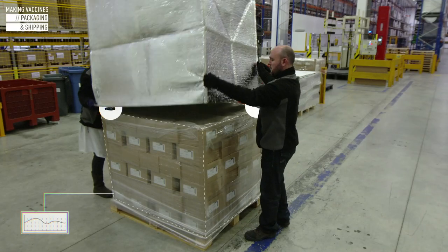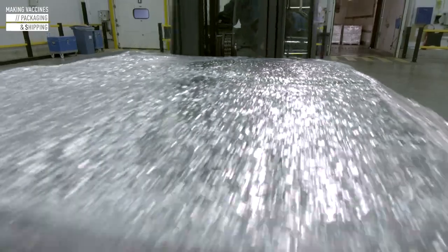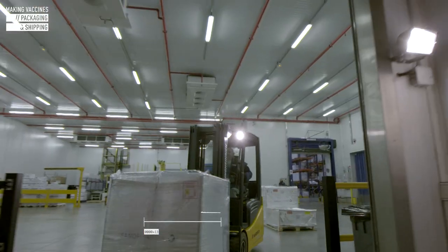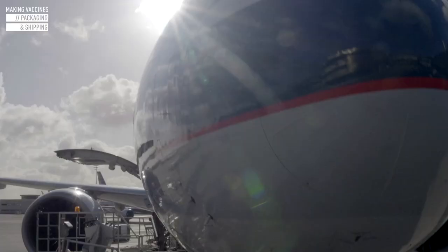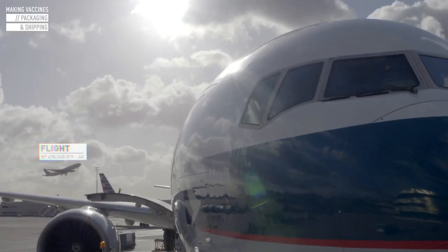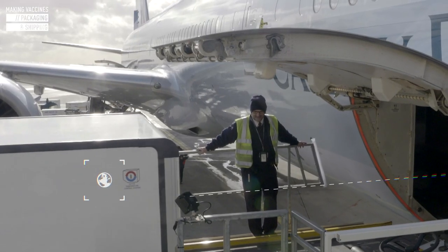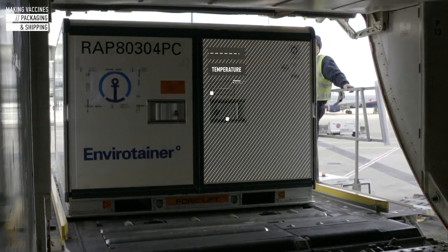Throughout packaging and shipping, vaccines must be stored between 2 and 8 degrees Celsius. Cold rooms and temperature-controlled shipping solutions, such as refrigerated containers and isothermal packaging, protect the vaccines during each phase of transportation and storage. A temperature tracking device is included in each shipment.